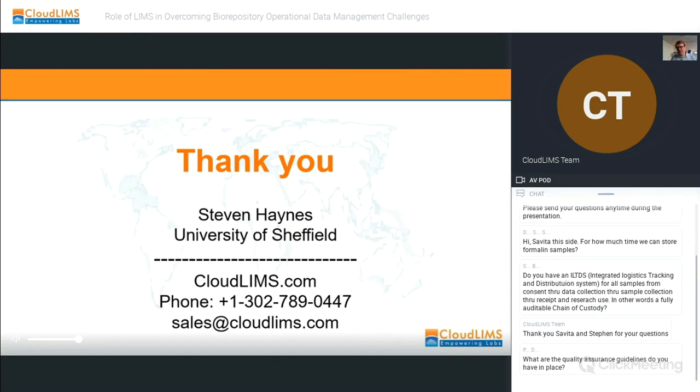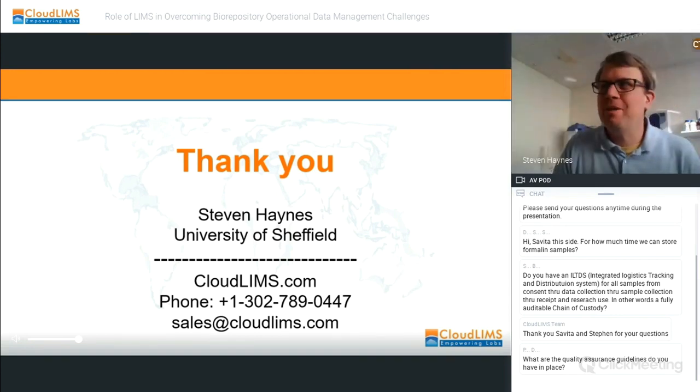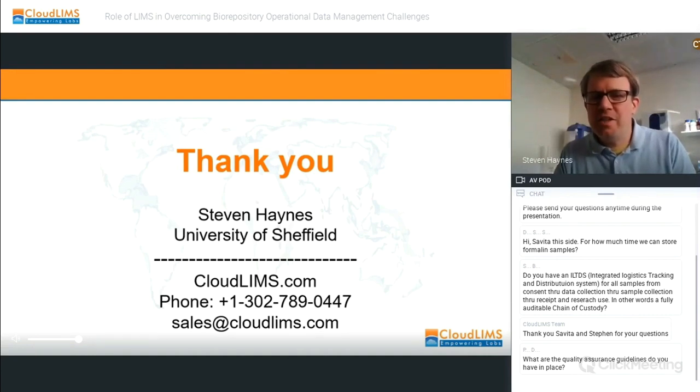Oh yes, okay. So our main backup, I guess, is we have CO2 backups on all the freezers. So we do have a backup for a few hours if a freezer goes down, but they're also constantly monitored and linked to a call center. So we have probes which would send an alert out, and we immediately get a phone call or a text message. And then because of the CO2 backup, we have a period of time, which, as I say, is usually about 5 or 6 hours to get to the freezer. If we can fix the problem, we'll fix it. Otherwise, we transfer it to a backup unit.